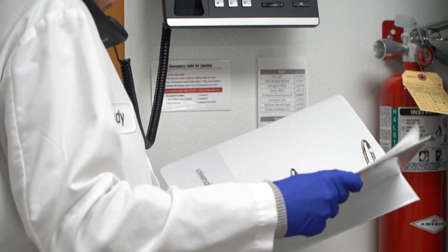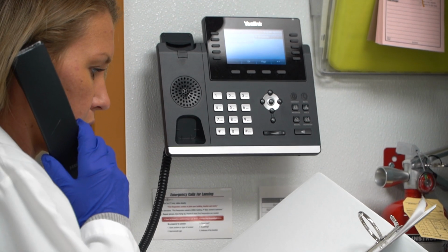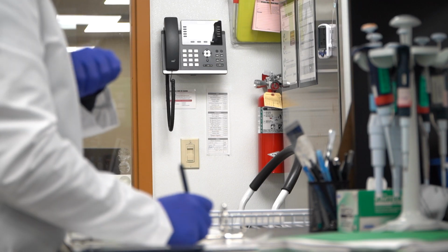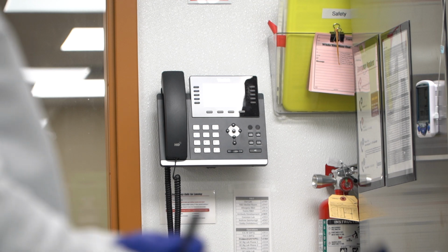And no one has that kind of time. The QA managers are working on the floor. They're not even at their desk. So here's the lab trying to call the customer, trying to understand what they wrote on their SAR form, and they can't get a hold of them. So what does that mean now? That means the samples sit on hold until we get a hold of the customer, delaying the whole process of getting the samples tested.